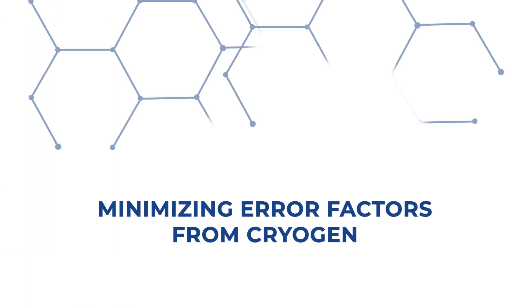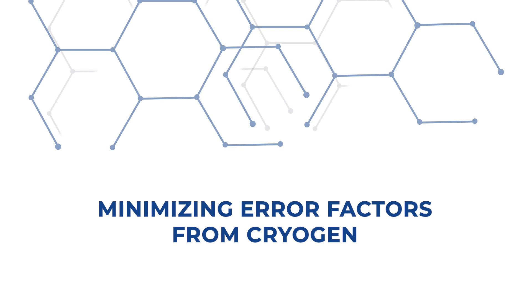Tip number five: minimizing error factors from cryogen. First, the purity of liquid nitrogen should be greater than 99.9%, since lower quality leads to higher measured saturation pressure.